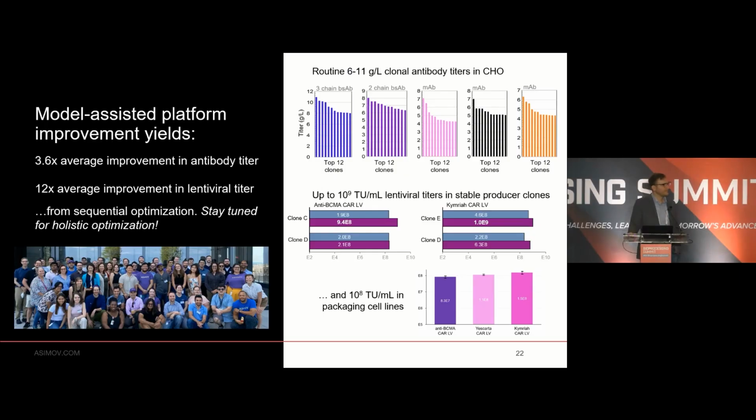Kind of talking about the data that you have at the end about your packaging cell lines, and I guess leading into the data that you're going to have with AAVs. How exactly do you go through modeling, say, the transient transfection process, where there's a lot of key attributes about that process that's going to impact your titer that may vary with scales and things like that?